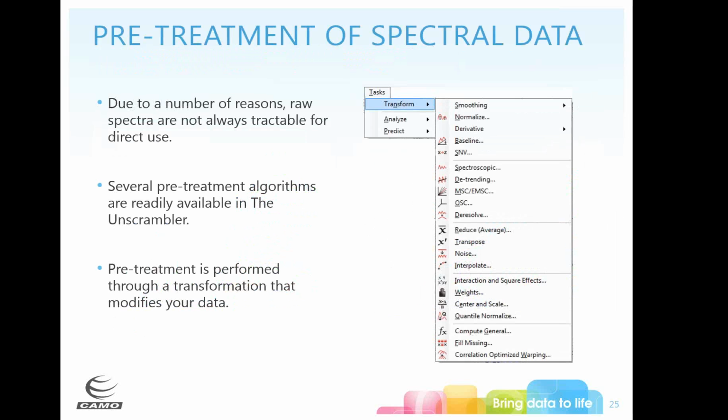We have a ton of different pretreatments that you can use. Almost everything needs some smoothing to it. You can see that things get a little noisy. Sometimes it's okay, you can leave it in there, but you want to do as little pretreatment as possible to your data and still get good output.